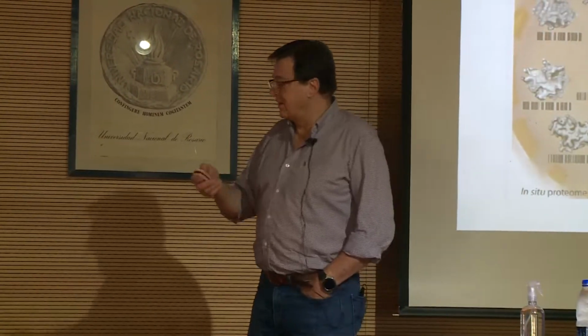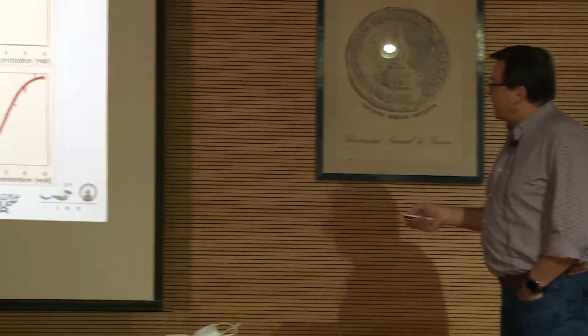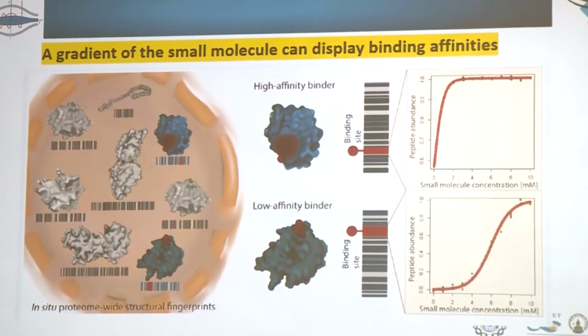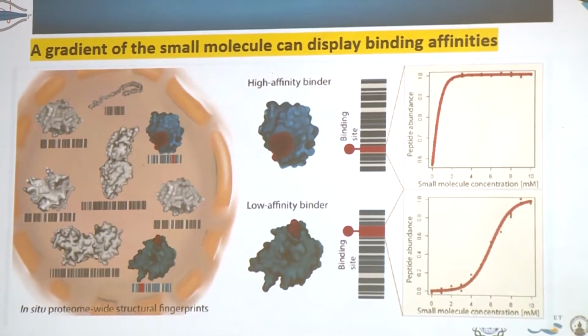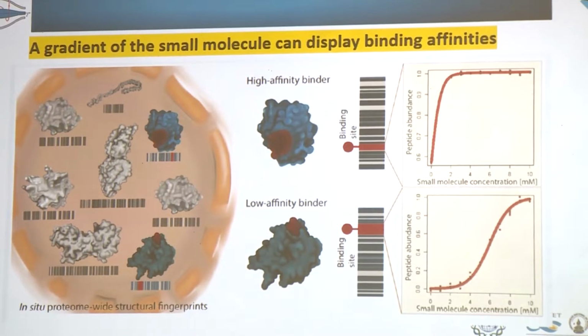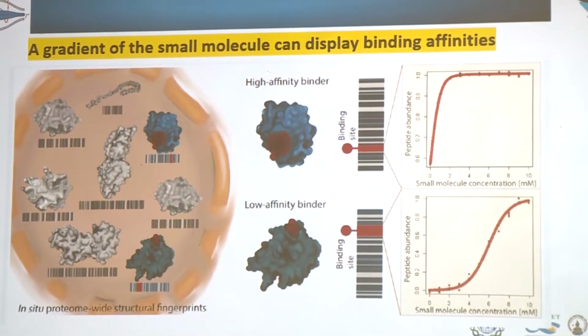So even more, going a little farther, if you have enough capability to run samples, you need to run several samples in your equipment.